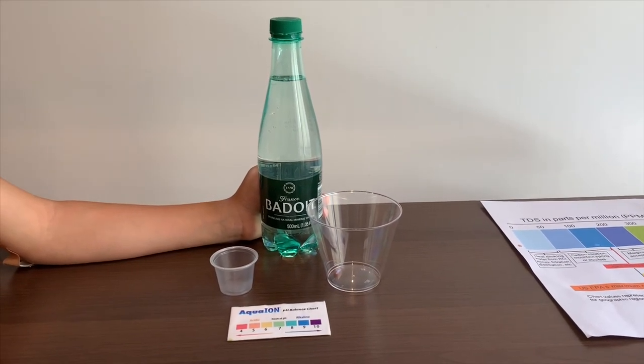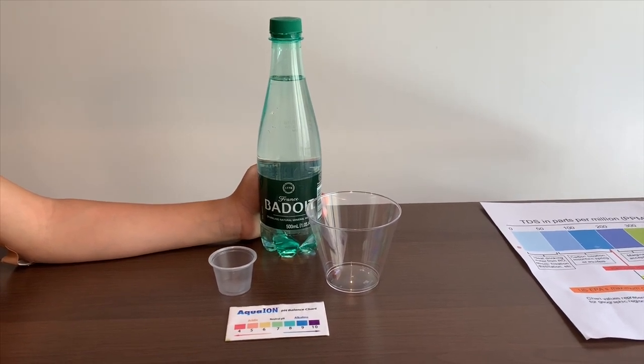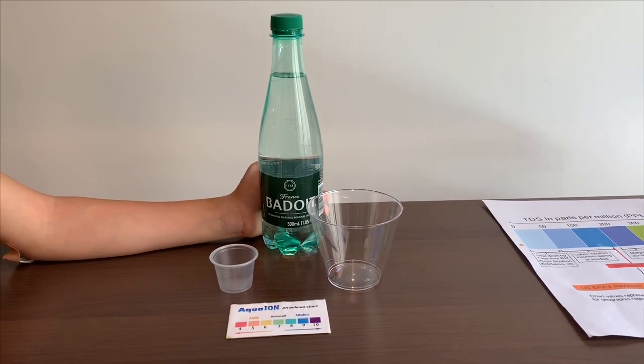This is Badoit Sparkling Natural Mineral Water sourced from France. It costs $1.49. Let's test the pH and TDS levels.